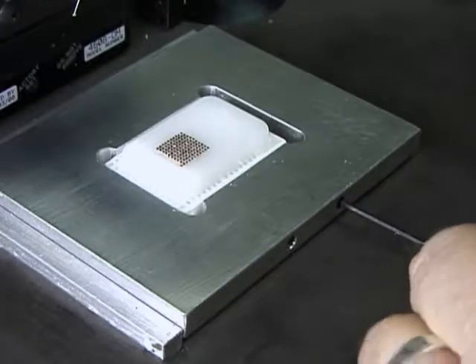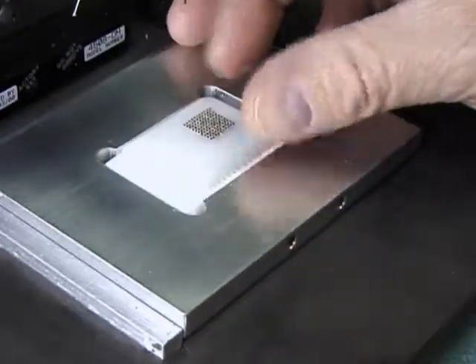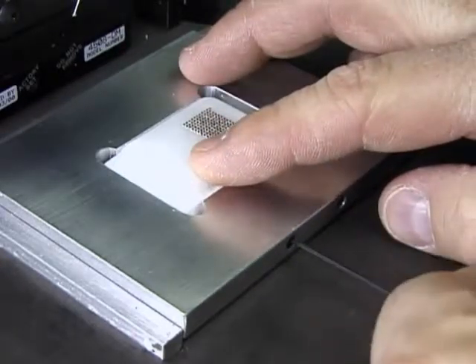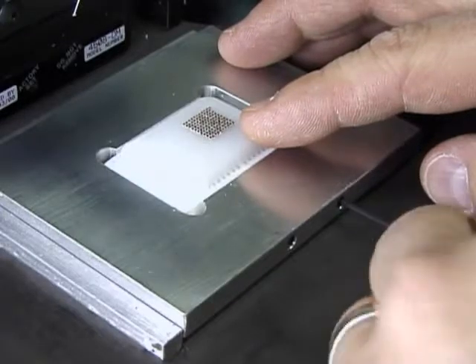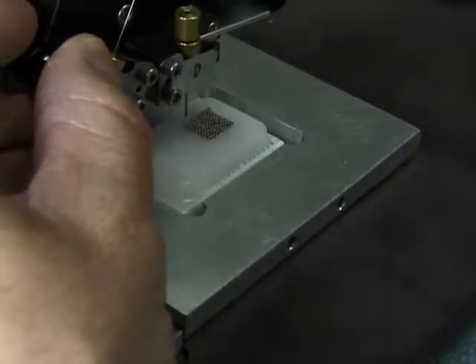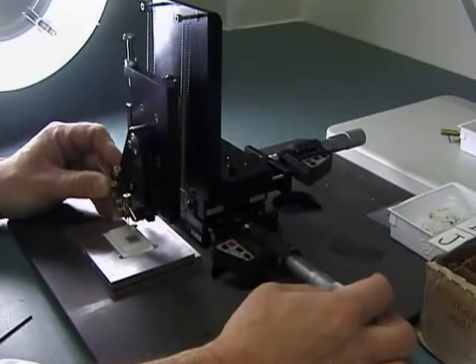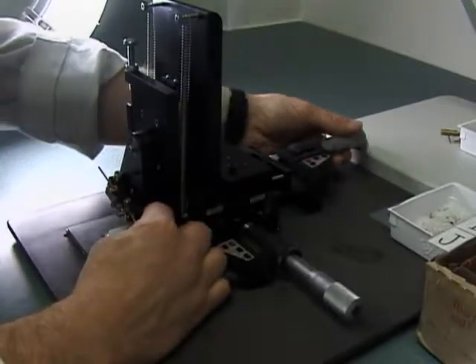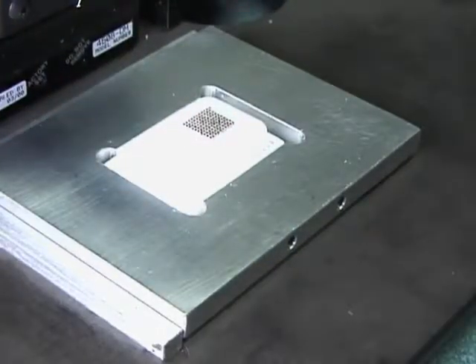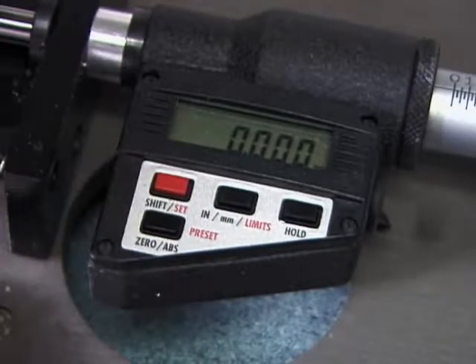When you have completed a group, this is the best time to flip the block. If you try to flip the block in the middle of a group, it will be very hard to match the rows. Uneven rows will confuse the slide reader. Match the needle up to the nearest punch to where you begin the next group. Zero the micrometer gauge. Try to separate the groups with at least 1 millimeter gap.